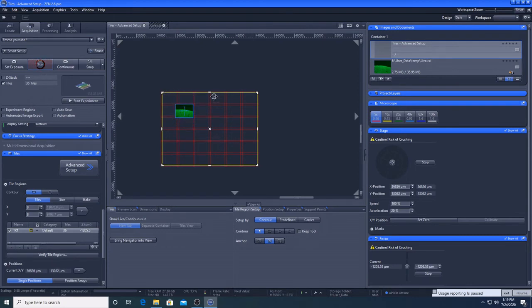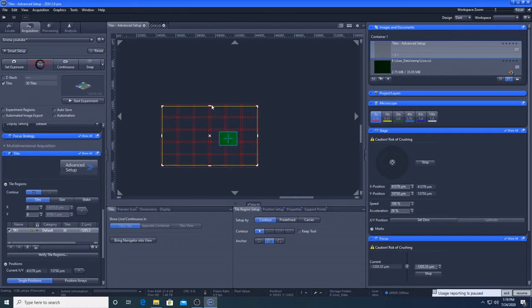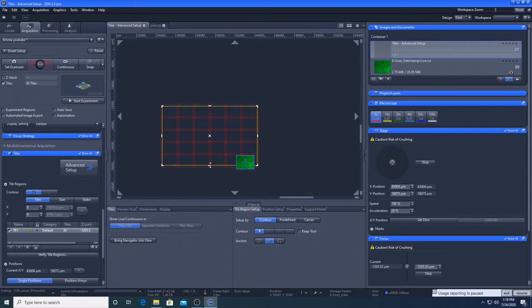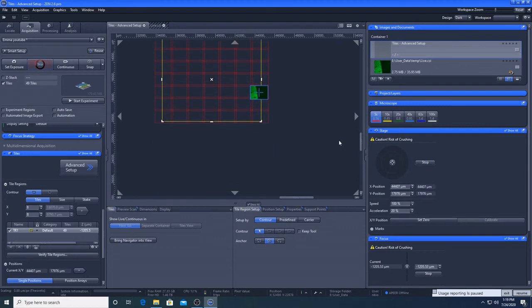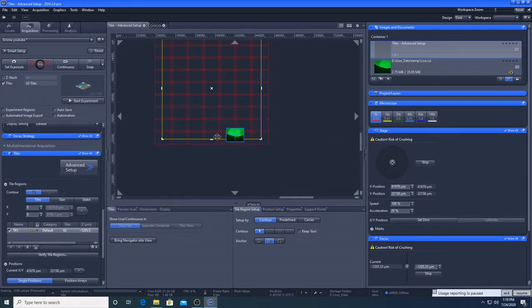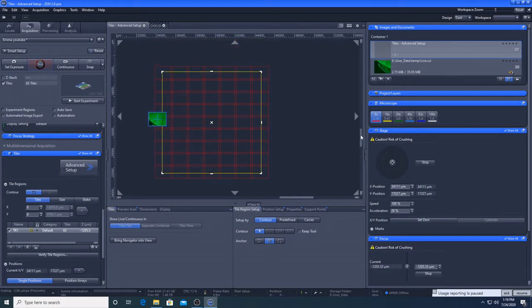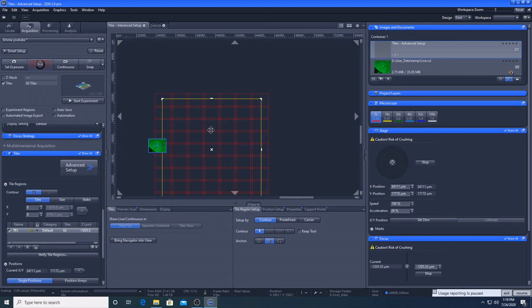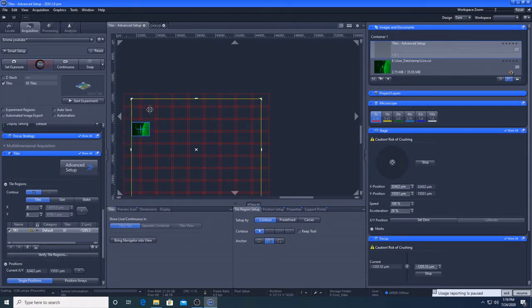So I found the top. So I'm going to drag this down, and that now marks the top. So I want to find all the far edges of this kidney. Now our entire kidney should be contained in this area.